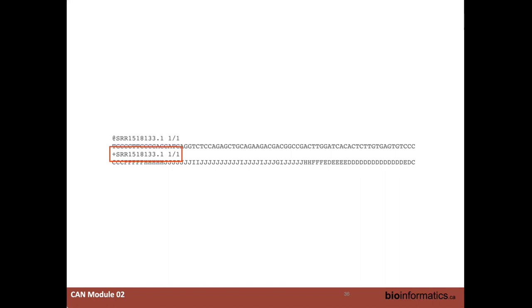Once upon a time, sequences were separate files from quality values, and so they needed a way to match those things up, and that's why they kept them separate. Nowadays, I don't think I have ever seen a single instrument segregate those into two different files. Also, I rarely see it that they actually use it. So we're just going to go back, and this is what you're going to mostly encounter, where it's just a plus sign. That's why I was saying before that the four lines consist of one sequence of interest.